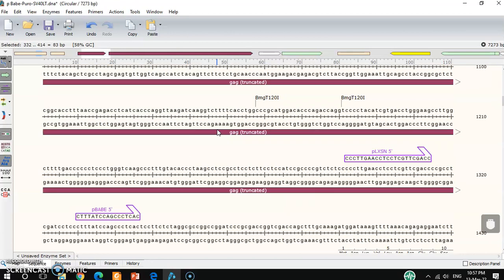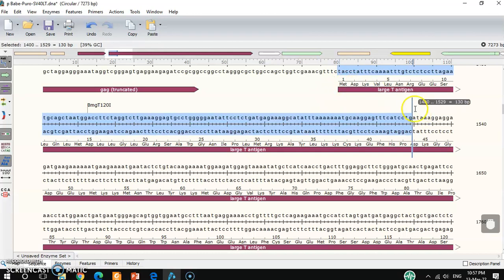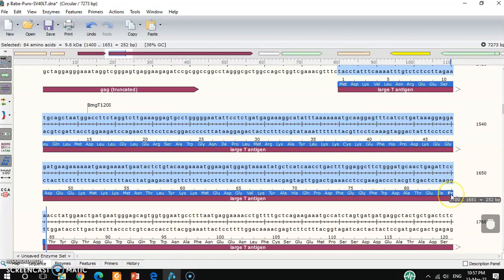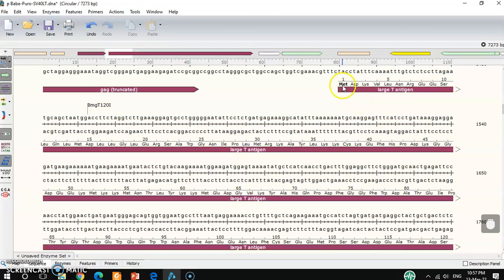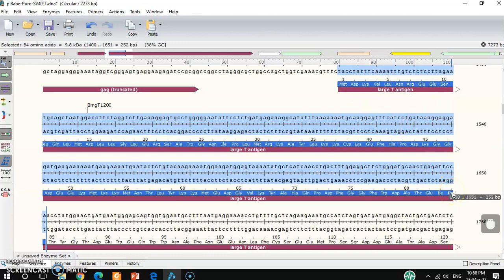And if you directly want to copy any protein sequence, then you have to click from here in the protein part, and you have to select the specific protein part with the left mouse button, and then just release it here.